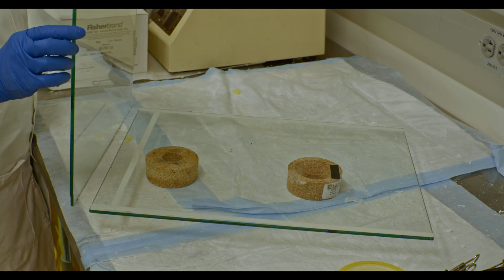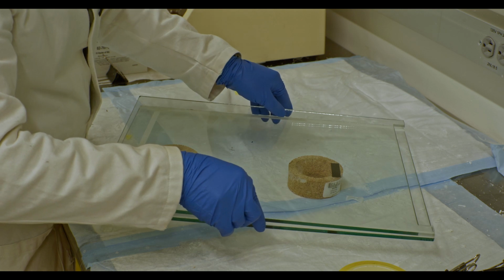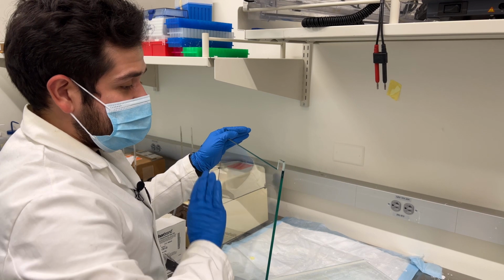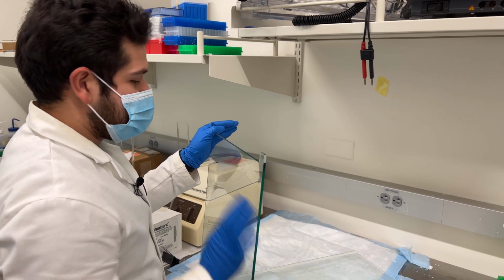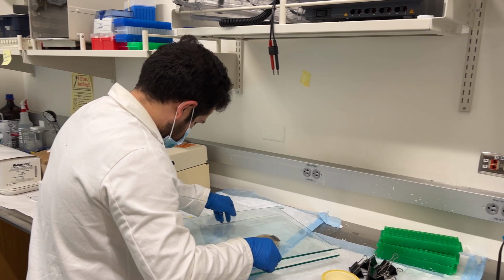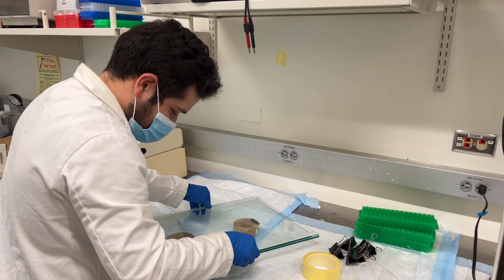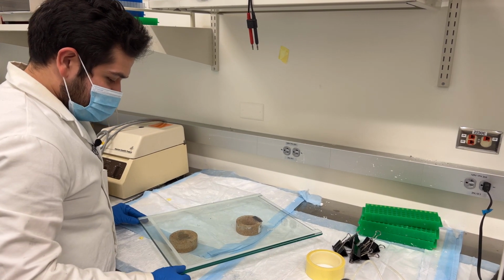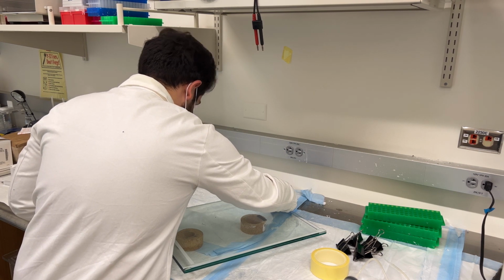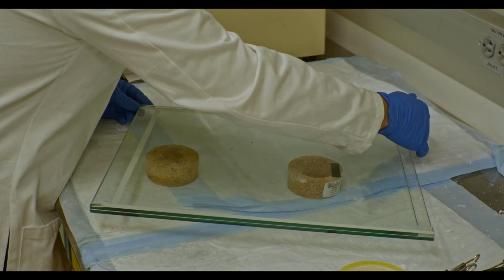Once you're done, you get your glass piece. Make sure that the siliconized face is actually placed on top of these spacers. Do whatever you have to do in order to remember. Sometimes I use a Sharpie on the opposite side where it's not siliconized in order to denote that that's the siliconized side. But in this case, I know that this is the right side because this glass piece actually happens to have a small crack at the right corner, and so I know this side is not the side that I've siliconized. So once you put the glass slides on top of each other, sometimes these spacers tend to move.